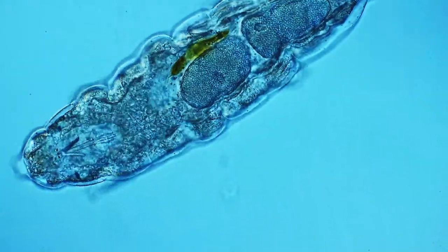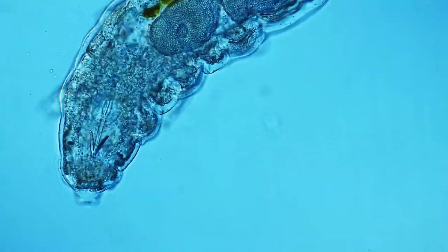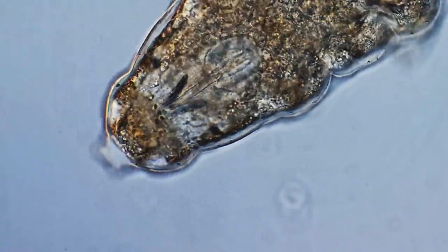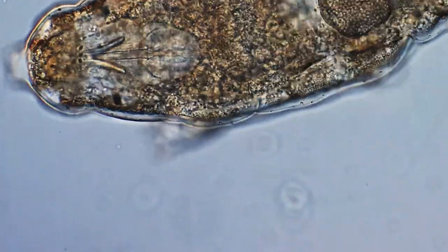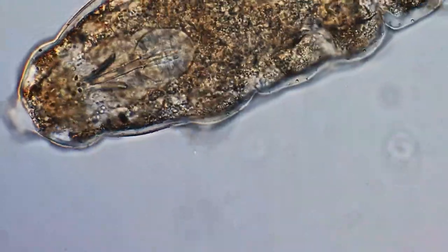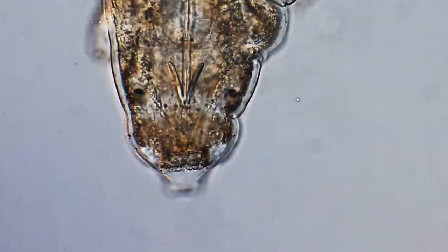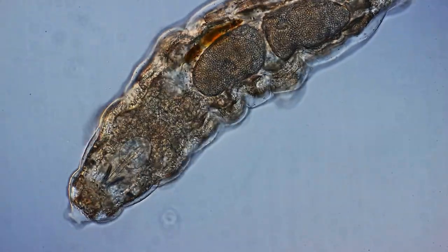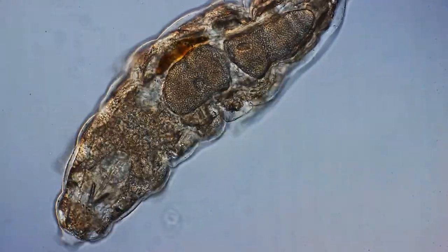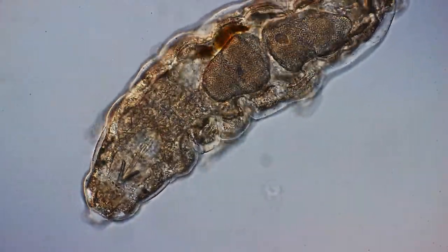I'm going to repeat it now again with the one where it's enlarged and no color tint added. You can see that simply by digitally zooming in, you can see some details that were not quite visible before. And then again the same clip, left without any color change here.